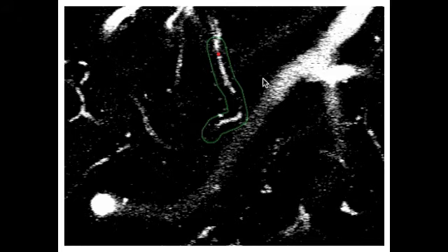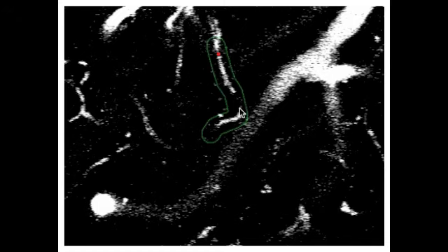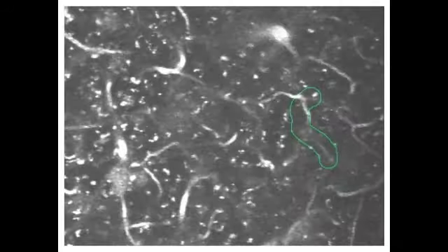You can see right there is the red dot that the experts annotated — they identified that stall. But it looks like there's also a stall down here.